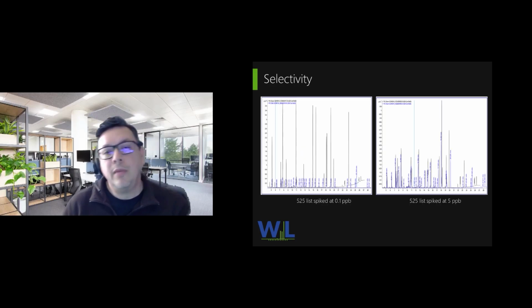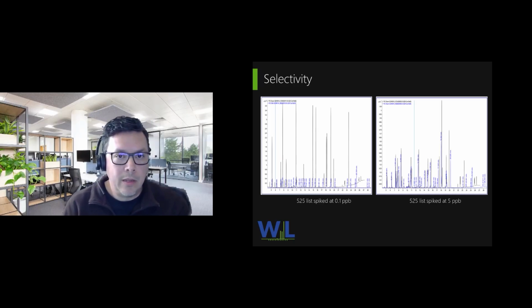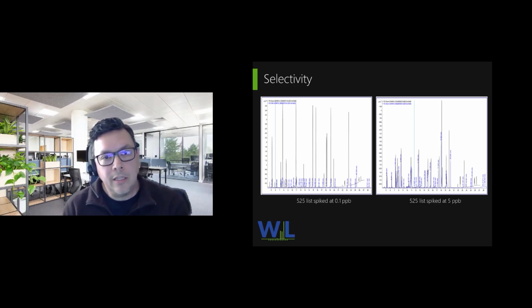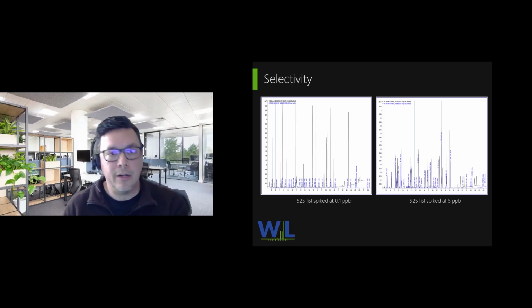So, selectivity. I wanted to make sure that I see what I wanted to see. The two chromatograms, right and left, are a low-level 525 standard and a mid-level 525 standard. The peaks are all there, sensitivity is there. Again, I see the high thermal bleed on the traditional column towards the end, 20-25 minutes of my run, for both the low-level and mid-level standard. And you can see the RMX column is pretty flat.